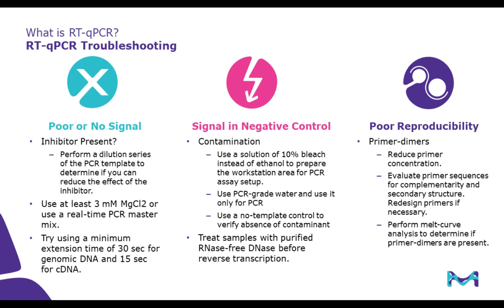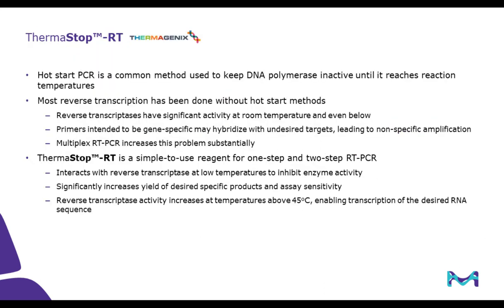Poor reproducibility is another common issue for RT-qPCR. Primer dimers can be avoided by reducing primer concentration, evaluating primer sequences for complementarity and secondary structure, and redesigning the primers if necessary. Finally, a melt curve analysis can help determine if primer dimers are present.